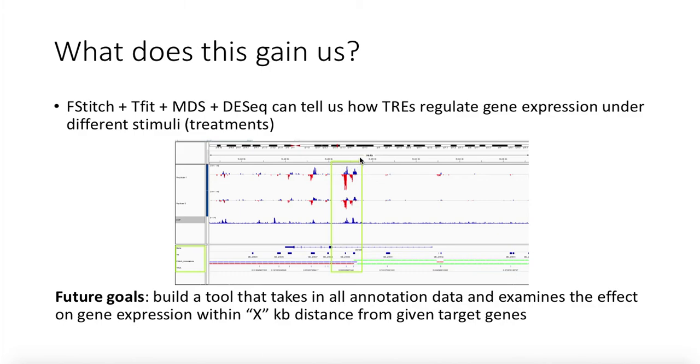together. You can see two very strong bidirectionals. You might say, wait, these bidirectionals are over an annotated gene down here in this track. However, this is an intragenic, intronic enhancer is what we would call these. So they are not over exons; this would typically get spliced out. So we still call this an intragenic enhancer. They don't typically fall over exons.